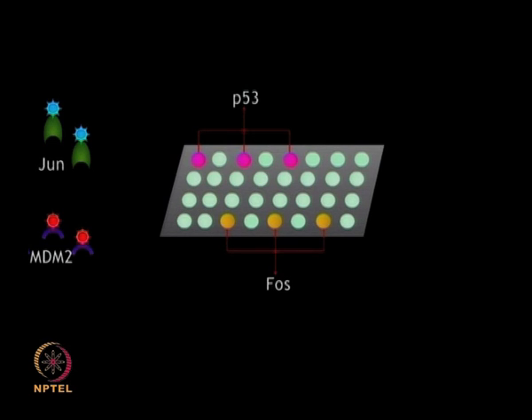Now, a proof of concept array is shown here, where well characterized proteins are printed on the array surface along with their corresponding query molecules shown on the left side labeled with different fluorescent dyes. Now, by using this interactivity, let us match the protein interacting pairs such as Jun and Fos, P53 and MDM2 by dragging the query to the correct protein on the array surface in order to see the signal output.